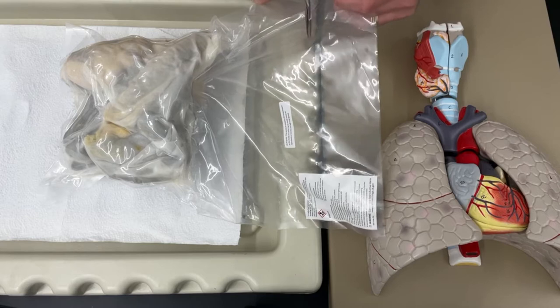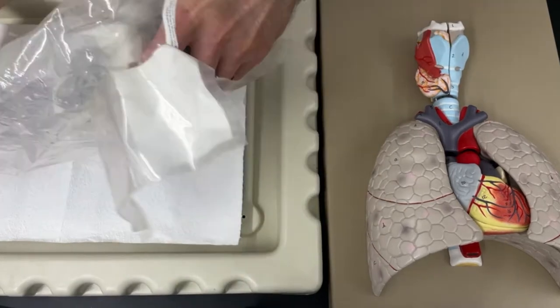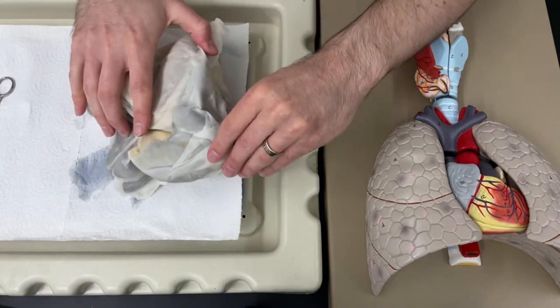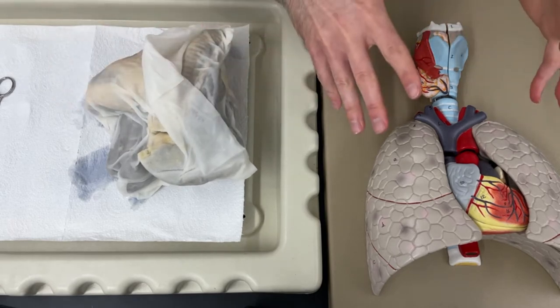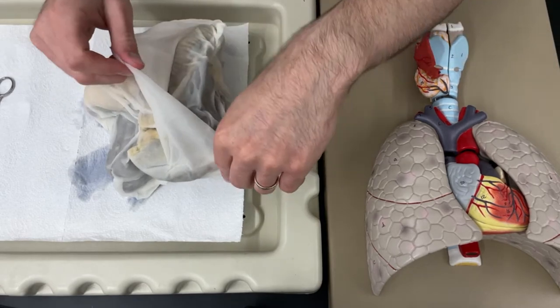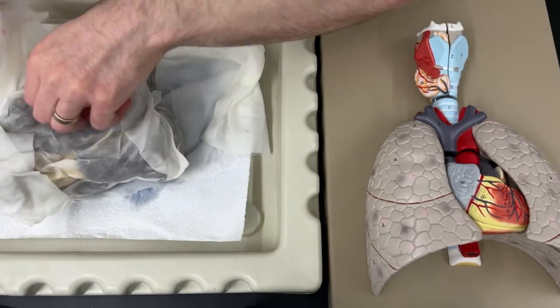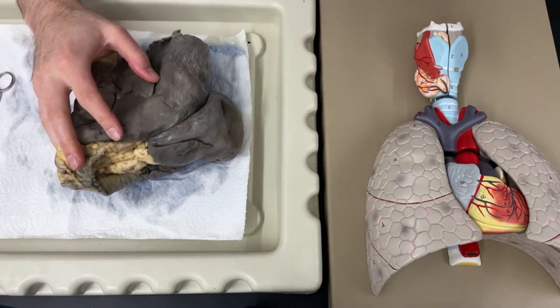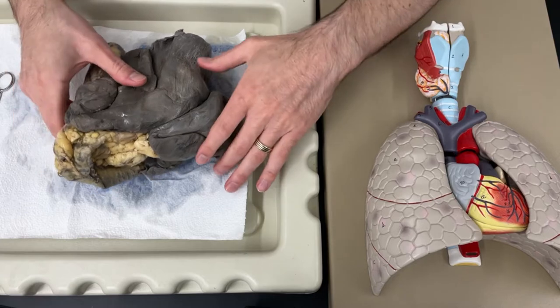First thing is I want to cut this open. I'm going to cut the bag along the top here. You'll notice this is wrapped - that's just to help preserve it - so we're going to unwrap this, and then I'm going to see if I can orient it so that it matches my model over here, which will help me understand where different things are located. All of the paper towel that this was wrapped in, I put that back in the plastic bag so that I can use that when I want to preserve this for the next lab period when we finish the dissection.